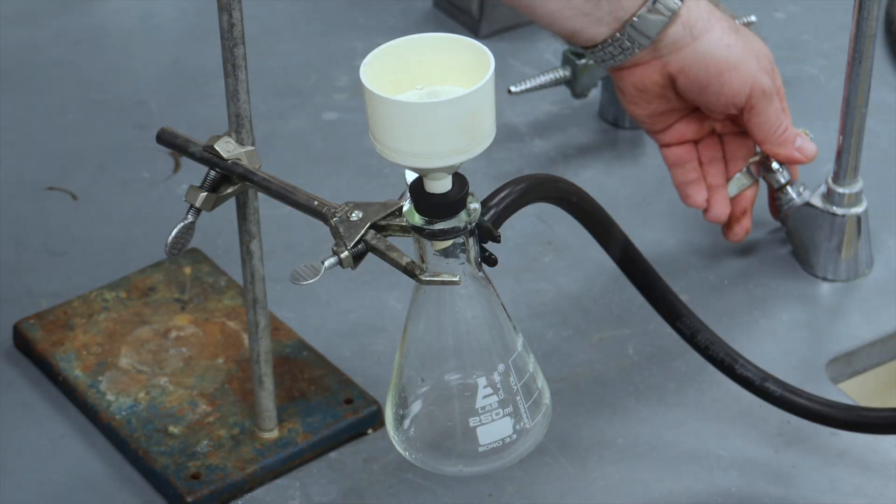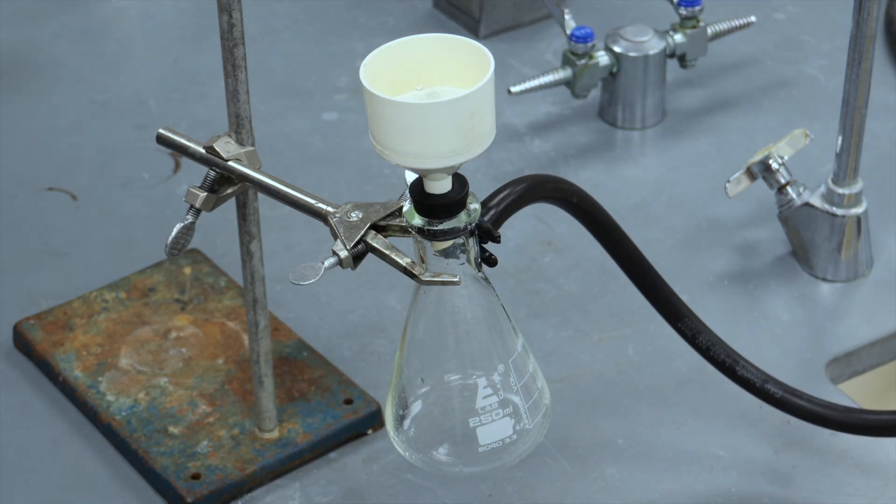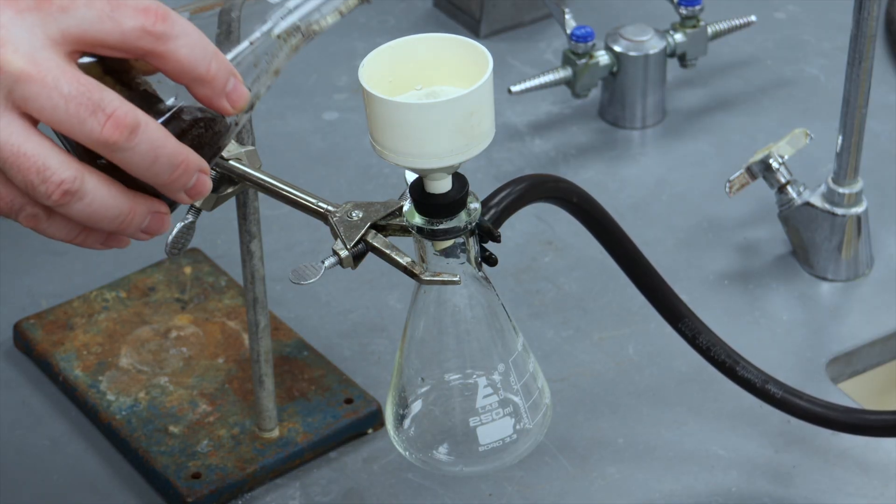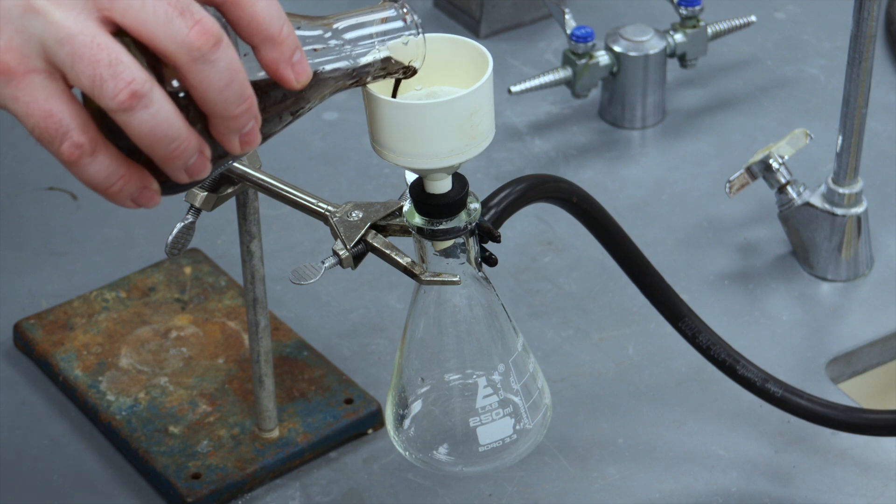Then, before you do your filtration, empty the vacuum flask of any solvent you collected. There shouldn't be any sea light in that liquid. Now, you're ready to do the filtration.